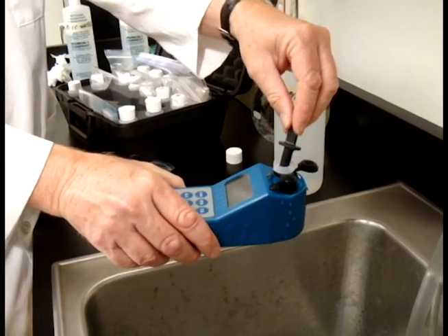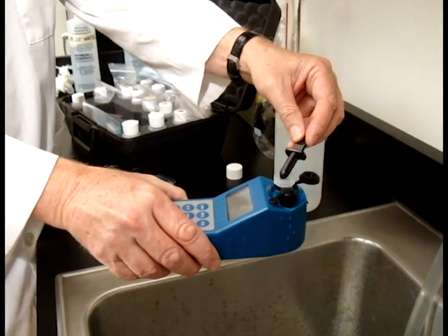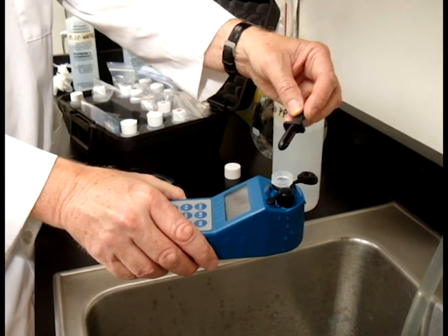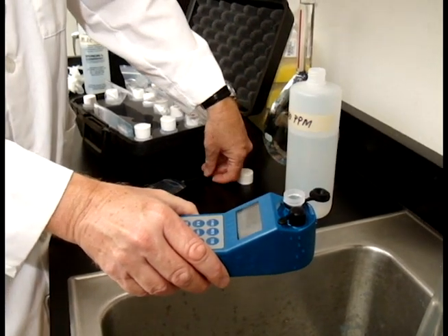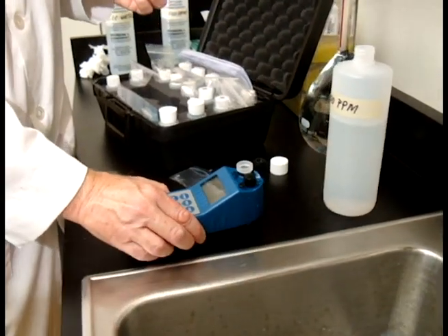Twist it a couple, three times like that. And then make sure that there's no excess. Tap it all out here because that will be needed. Then just get rid of the excess and you're ready to begin your titration. Thank you.